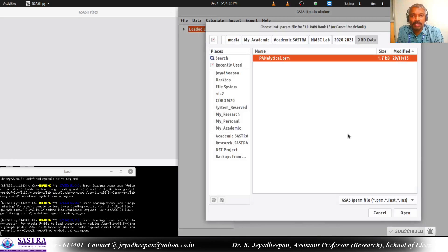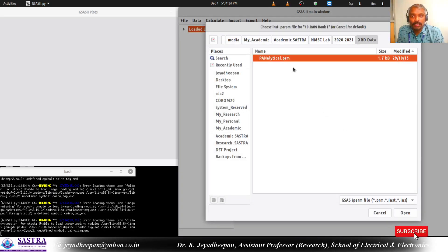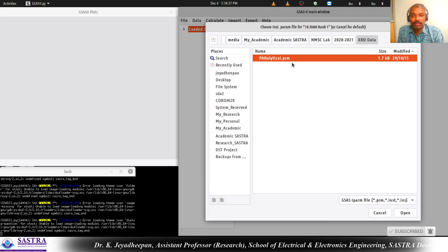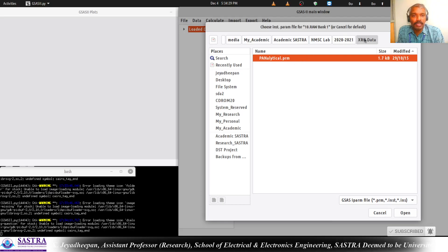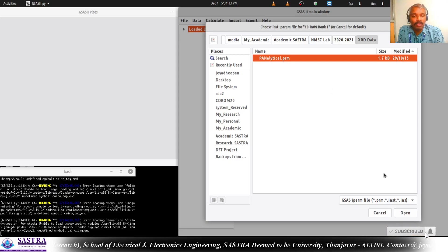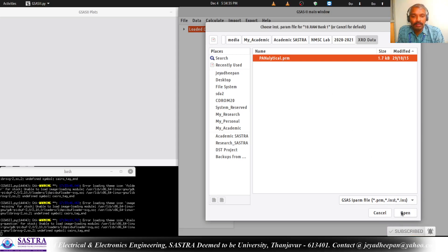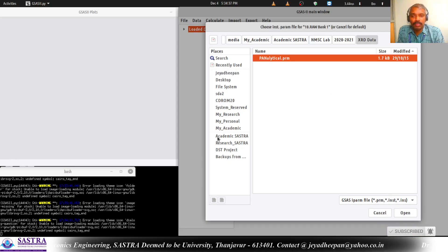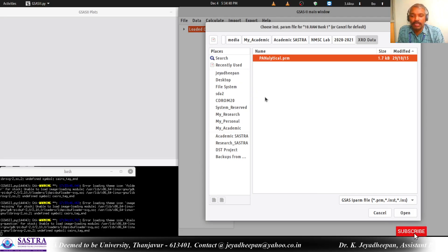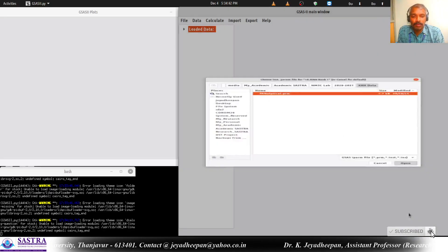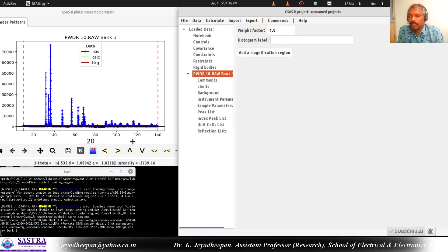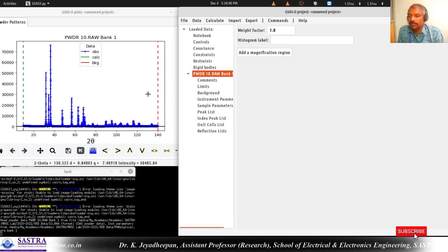Now it will be asking you for the instrument parameter file. Here in the same XRD data folder I have the Panalytical .prm file, so you just simply open it. Otherwise you can browse the location of the file and open that. I am simply pressing open. Now the data is loaded for our semi-quantitative phase analysis.